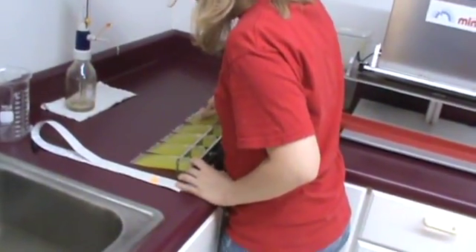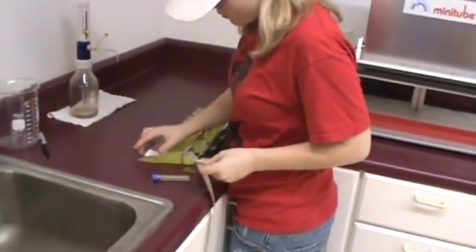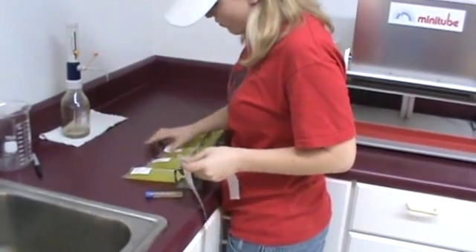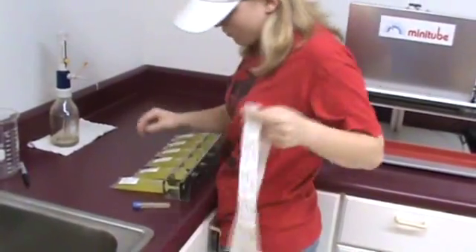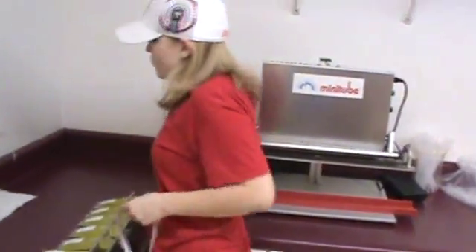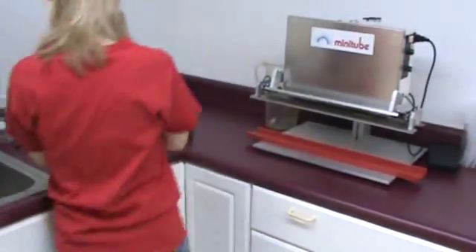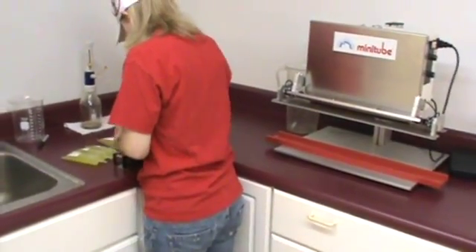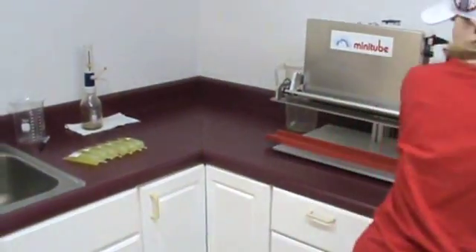Each and every tube that leaves Prairie State is squeezed before it leaves here to ensure we have a good seal. She will now put the stickers on. After the stickers are on, she will carry it back to a metal tray that we have in another room. There goes the sample. She will take out those tubes and carry them back to the tray, and after we get a full tray, that tray will be carried back to our semen cooling and packing room.